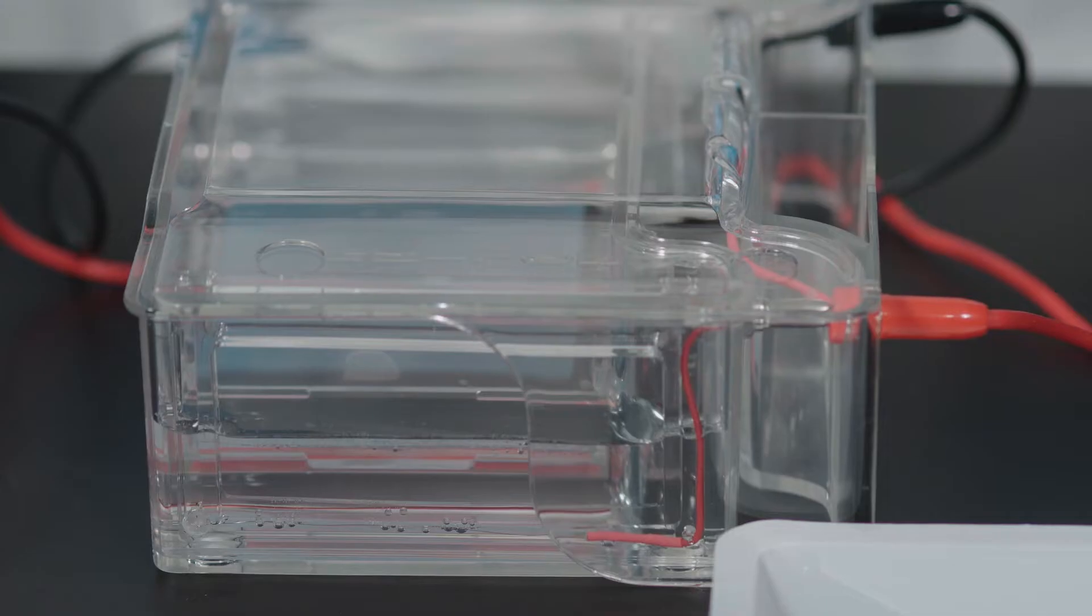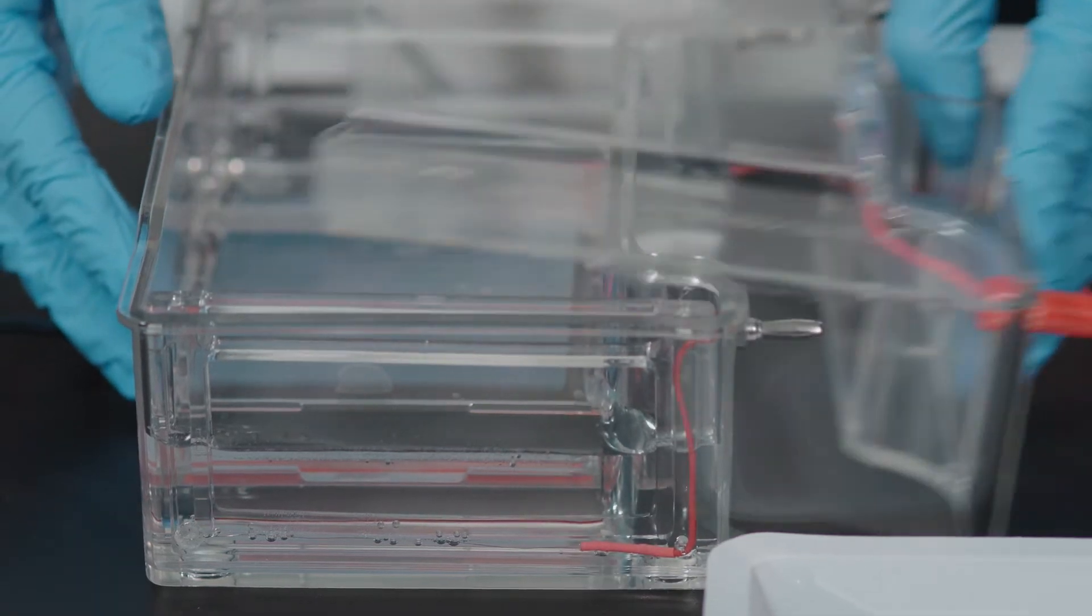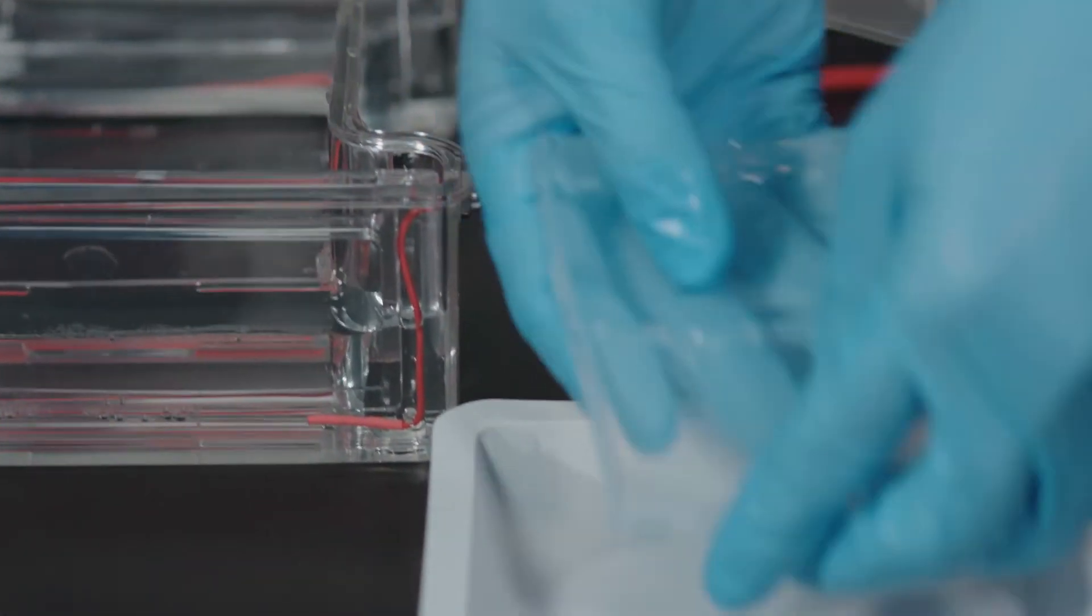After running your gel and safely turning off the power supply, remove the electrophoresis chamber lid and gently transfer the gel onto a staining tray.